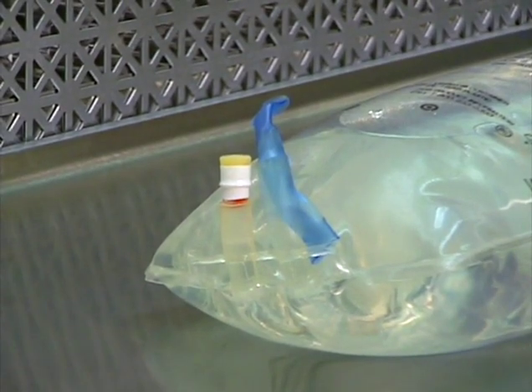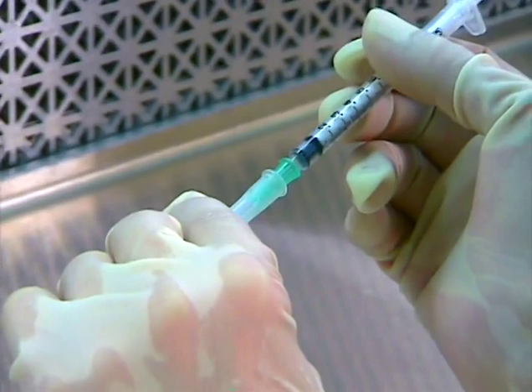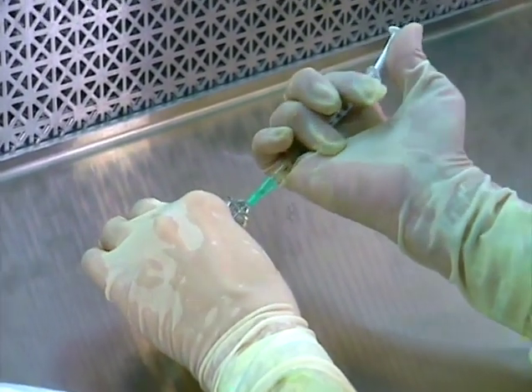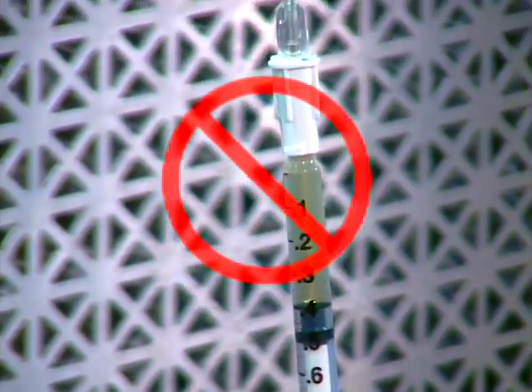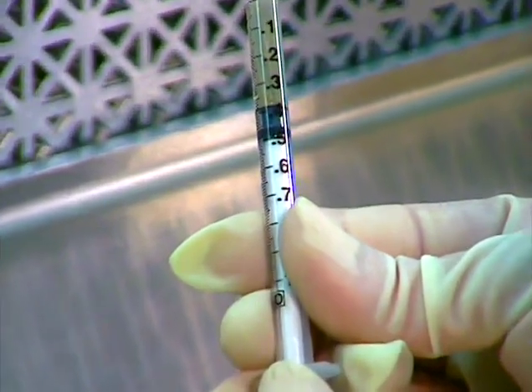Tuberculin syringes are often used to measure and add very small doses to an IV admixture. However, the needle on a tuberculin syringe is not long enough and must be changed prior to drawing up a dose. This is done because the amount of diluent required to fill the new needle may be greater than the amount that was in the small tuberculin needle and may represent a significant portion of the small dose normally drawn up in a tuberculin syringe.